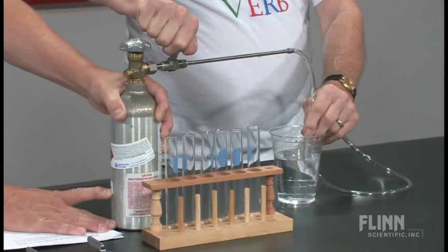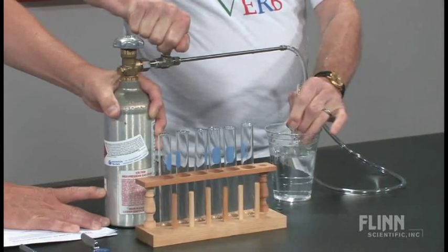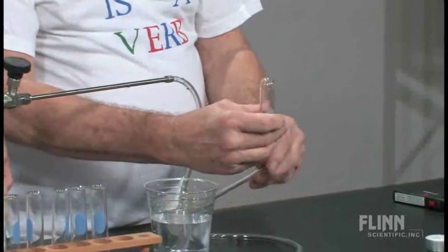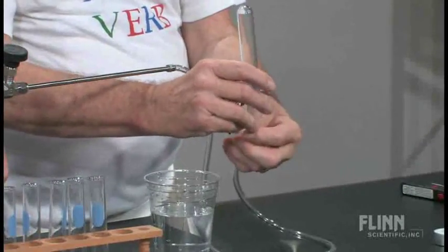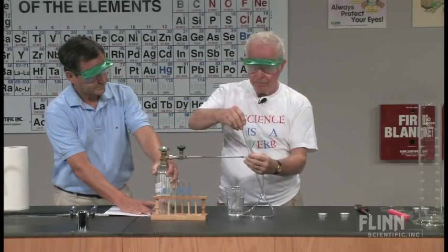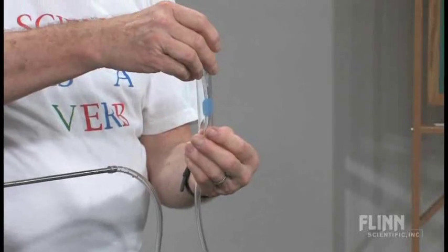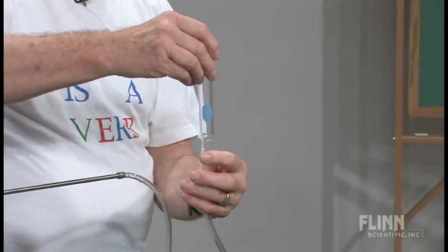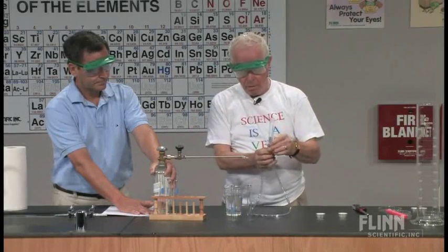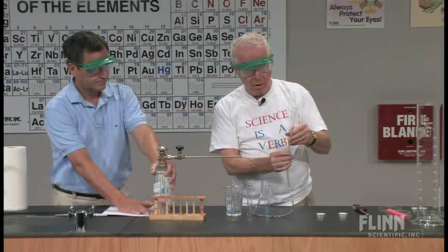First I'll bleed any hydrogen gas I have in the tube — out of the tube. Now you know that hydrogen is less dense than air, so I'll collect it by the downward displacement of air. Now I can feel the gas coming out of the bottom of the tube, so I get an idea as to when the tube is full. I'll just fill four of them, and if I need more afterwards I'll do that afterwards.